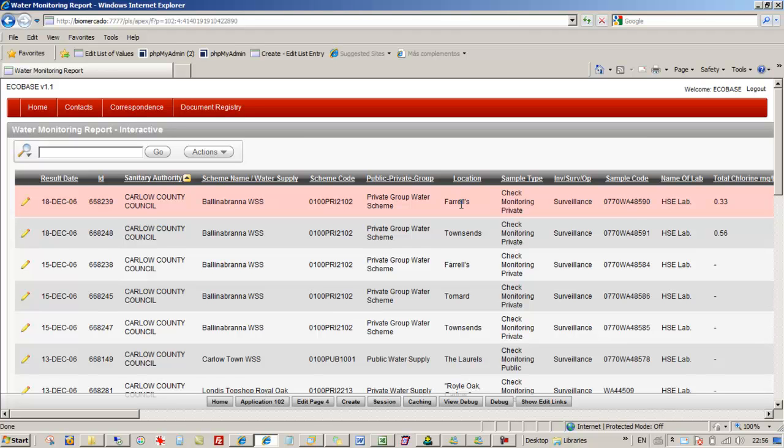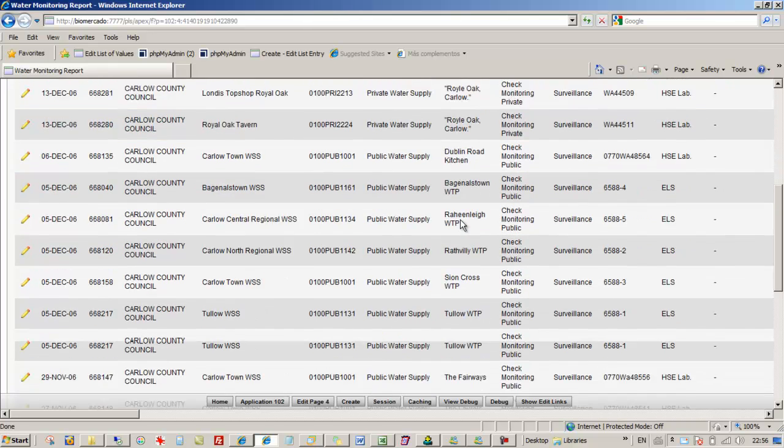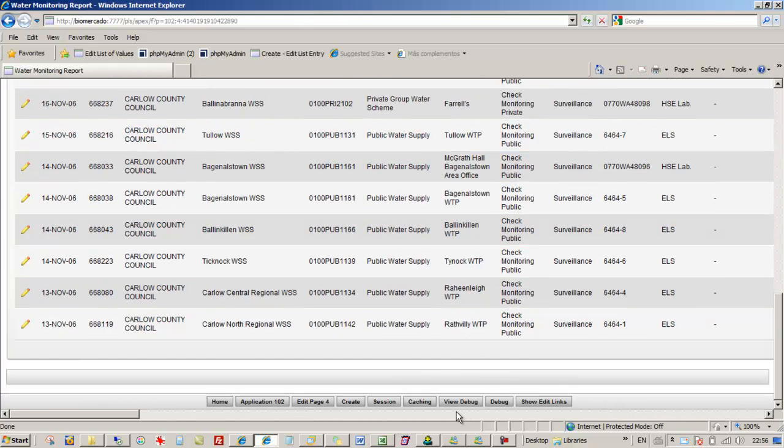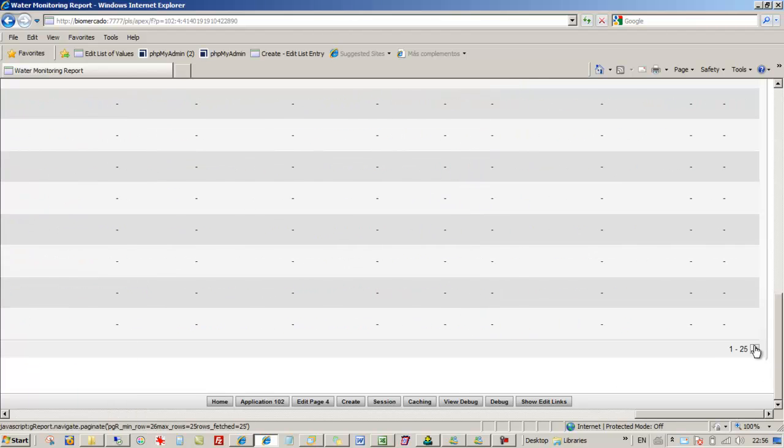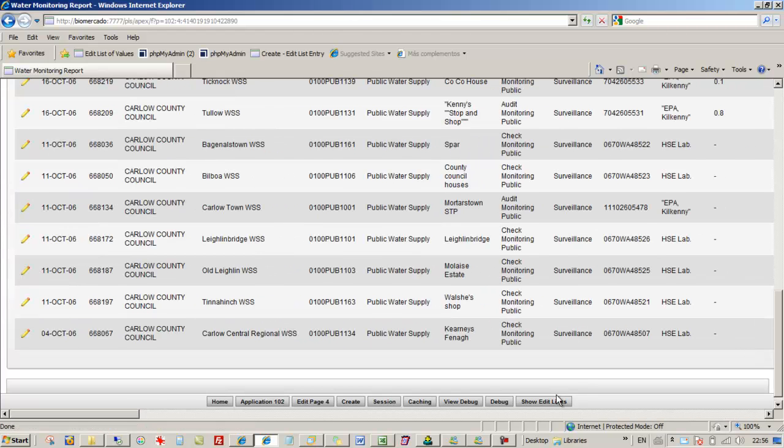What you'll see is a mega report like this with all the results that are stored, sorted in pages. Now, there are about 20,000 results per year in Ireland, and we're going to store about 10 years maybe. We should plan for that anyway. So it's probably talking about 200,000 results. So when you get this opening page, you get a group, which is not all of them obviously on the first page. It's divided in pages and you move down the report by clicking on that here.